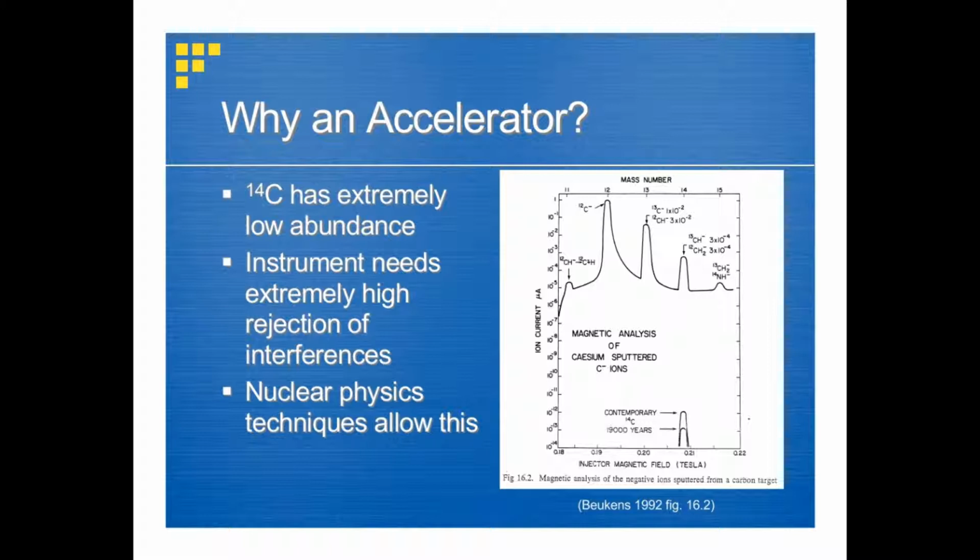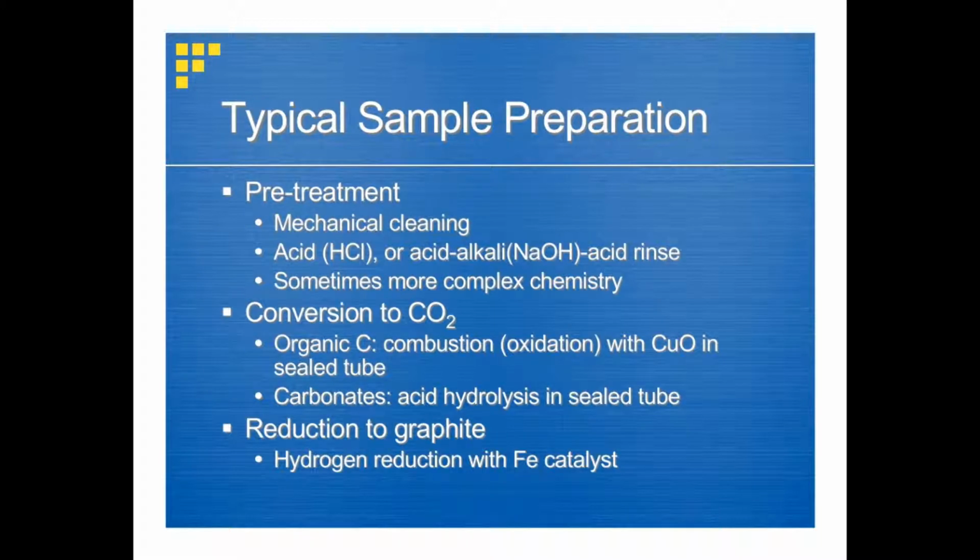I want to briefly mention the sample preparation. There's some mechanical and chemical pretreatment. And then the sample has to be converted to CO2. And then that CO2 is reduced to graphite. The graphite is then put into a sample holder, and that's put into the accelerator.